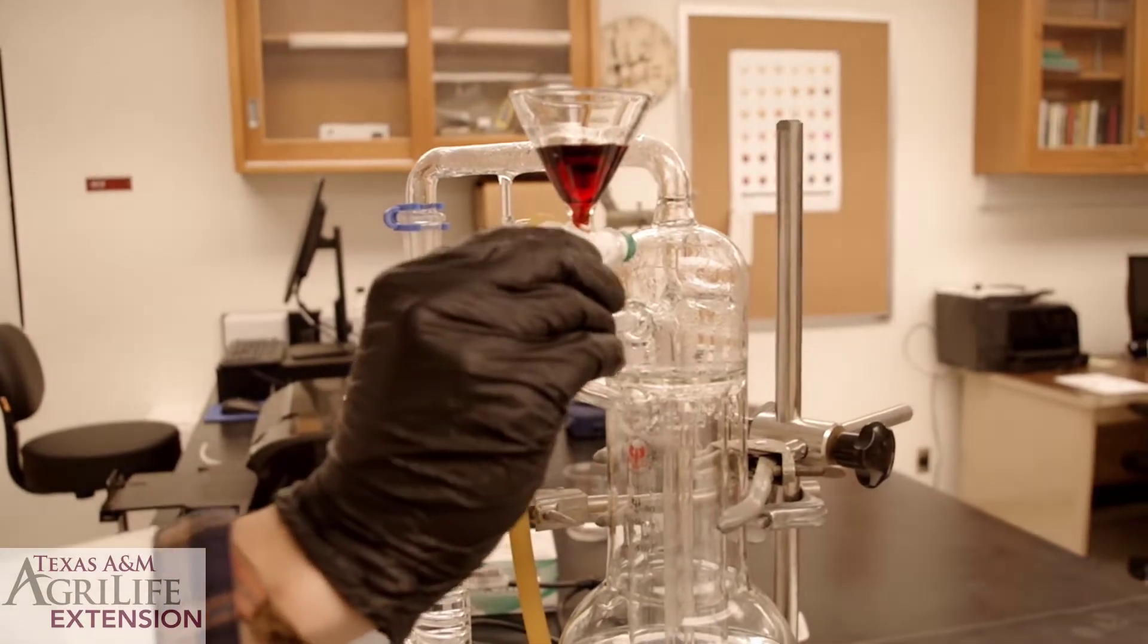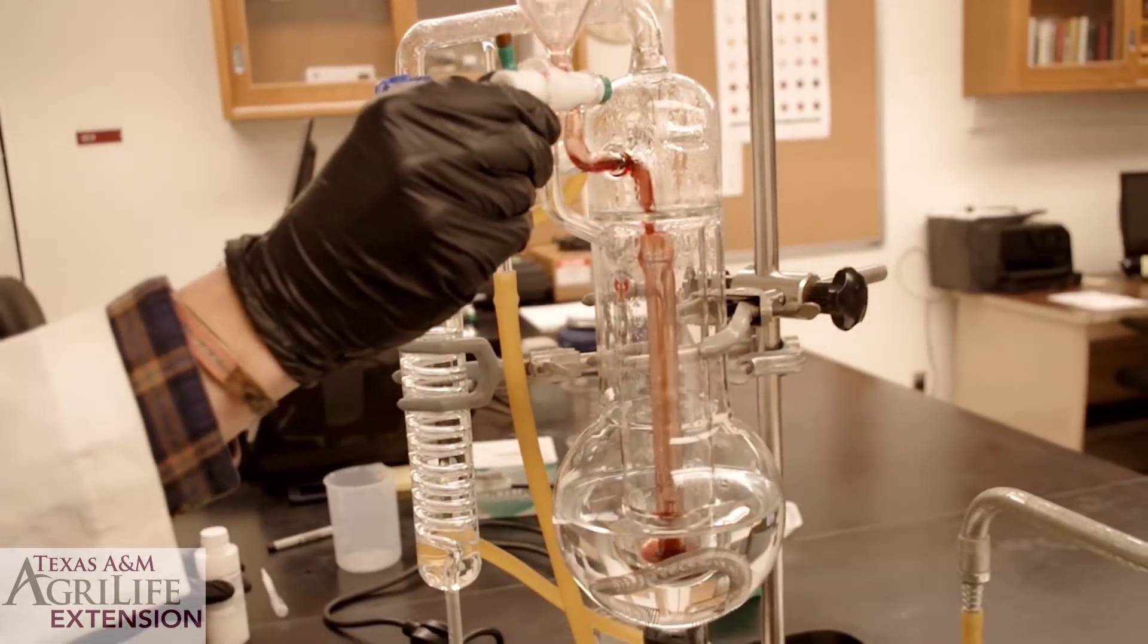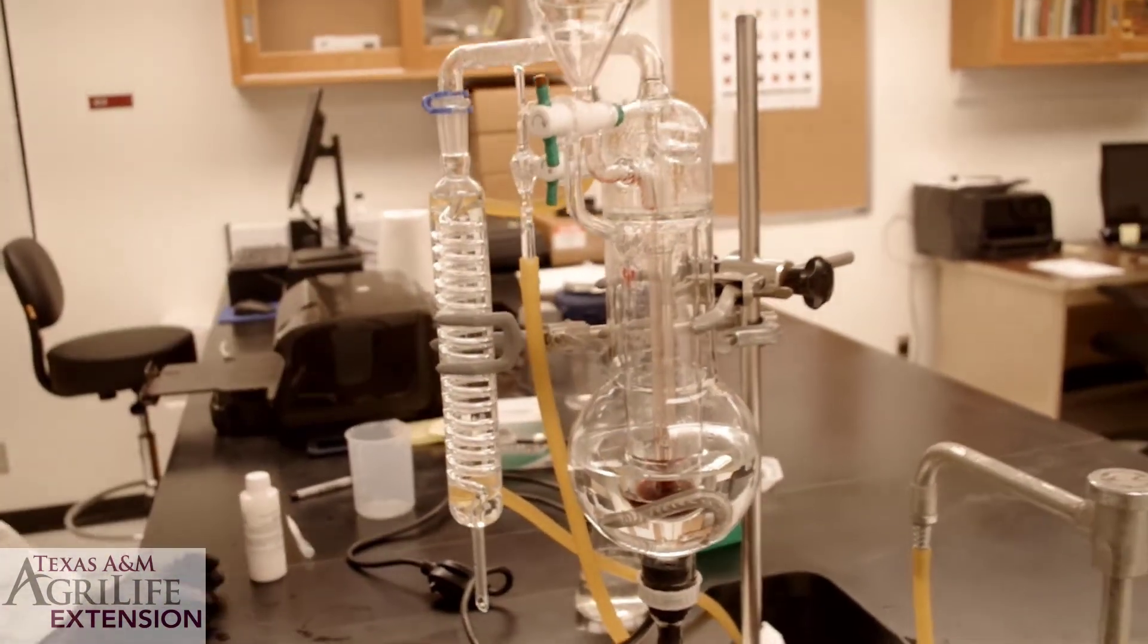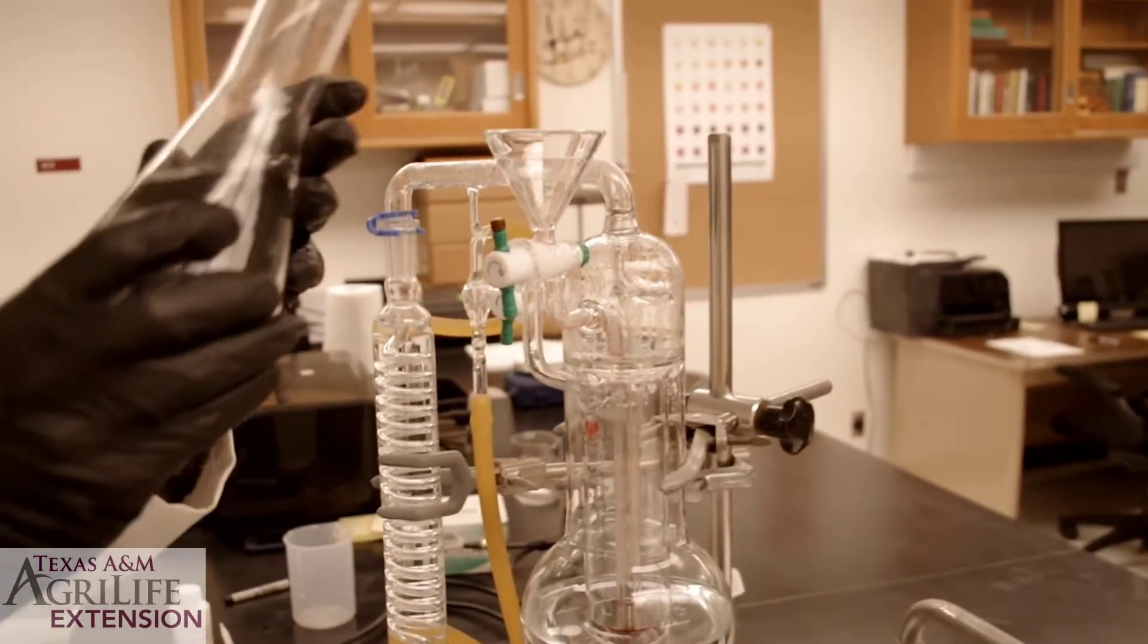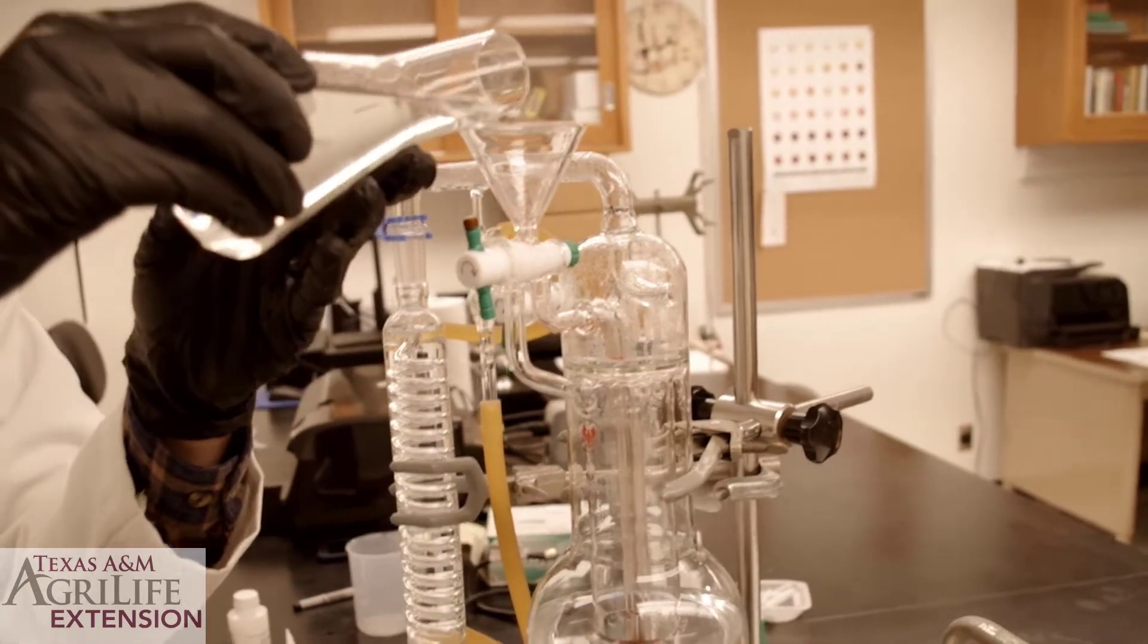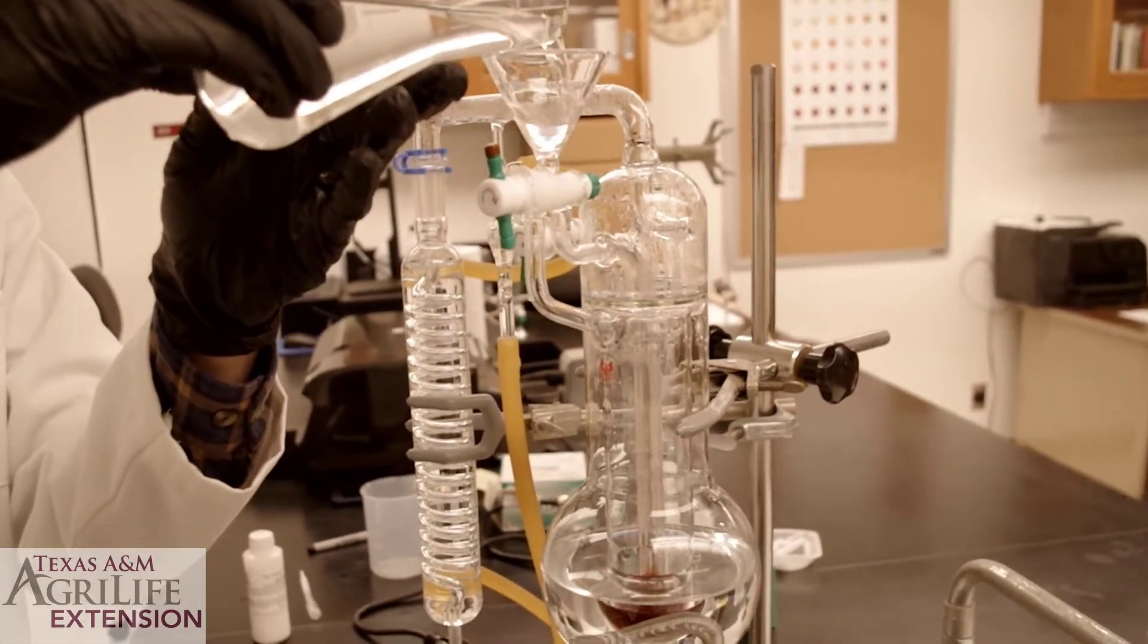Turn the stopcock clockwise to the vertical position with the red end up. Add about 100 milliliters of distilled water to the sample chamber.